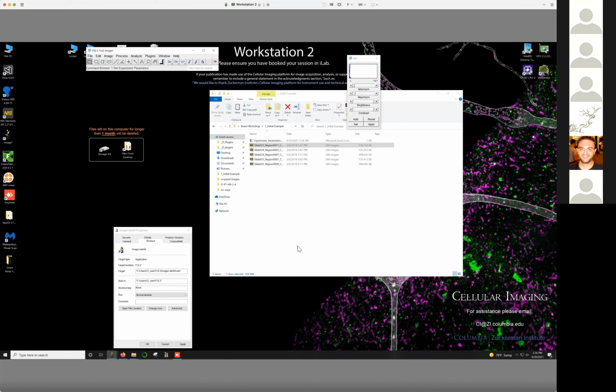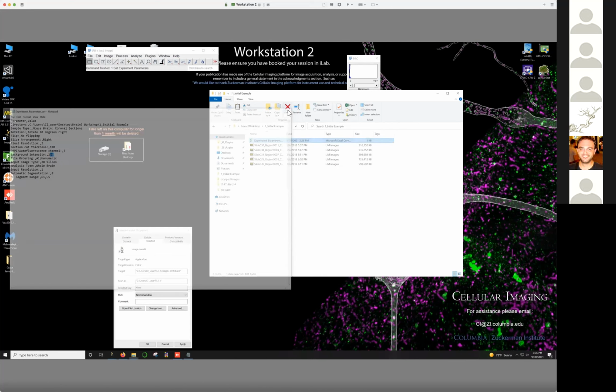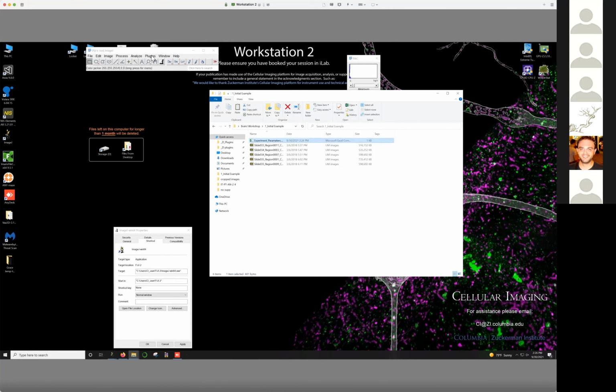So that's it. If I had other brains, then I would just do this step again. And just so you know, if you need to change these, the easiest way is to right click and edit this. These are just a simple CSV file. So if something doesn't work here, maybe the background wasn't very good, you can just come in here and change the value and then save this file, and it'll be an easier way of reprocessing the data set.